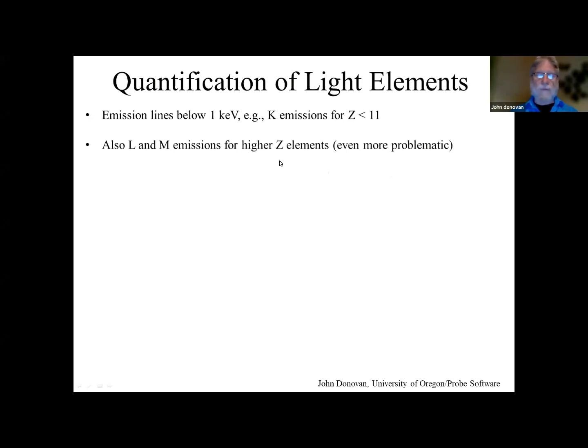which can also be quite problematic. This may require layered dispersive element Bragg crystals, which in some cases might need to be optimized for each line. The composition of the multilayers for oxygen, for instance, is usually tungsten and silicon, because those elements don't absorb oxygen very much. And for nitrogen, carbon, beryllium, and boron especially, you might need crystals that are optimized just for that X-ray emission line. So you might need to configure the instrument for the specific applications that you're dealing with.